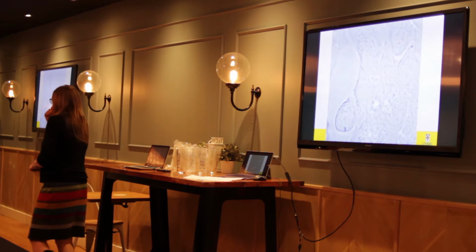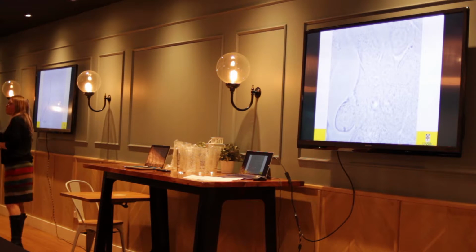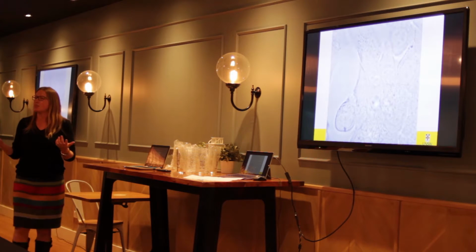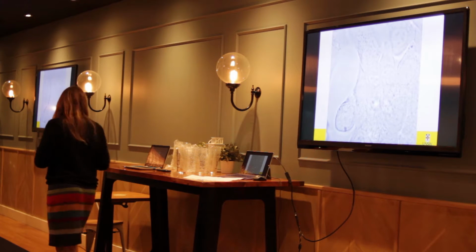What does it remind you of? It's what it is. It's cardiomyocytes. Okay? So we take cardiomyocytes and we monitor the beating frequency, and then we can treat them with different drugs like doxorubicin. One of the biggest side effects is cardiotoxicity. How does it affect the beating? Okay?